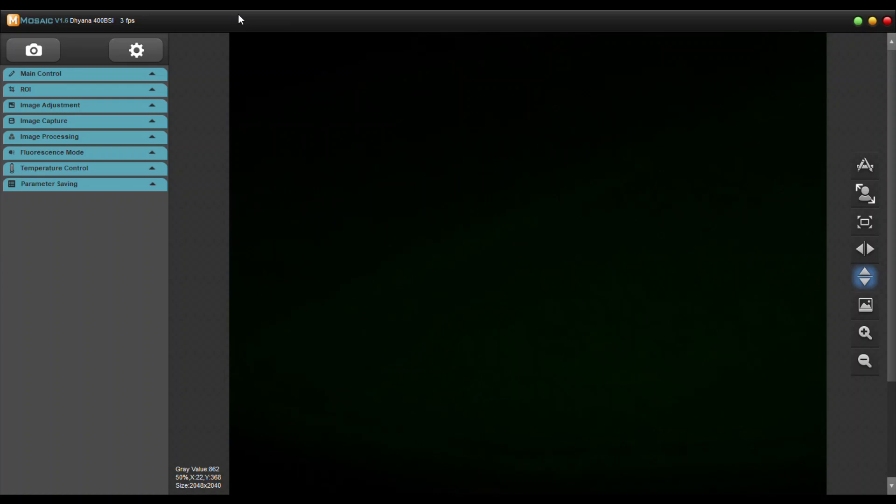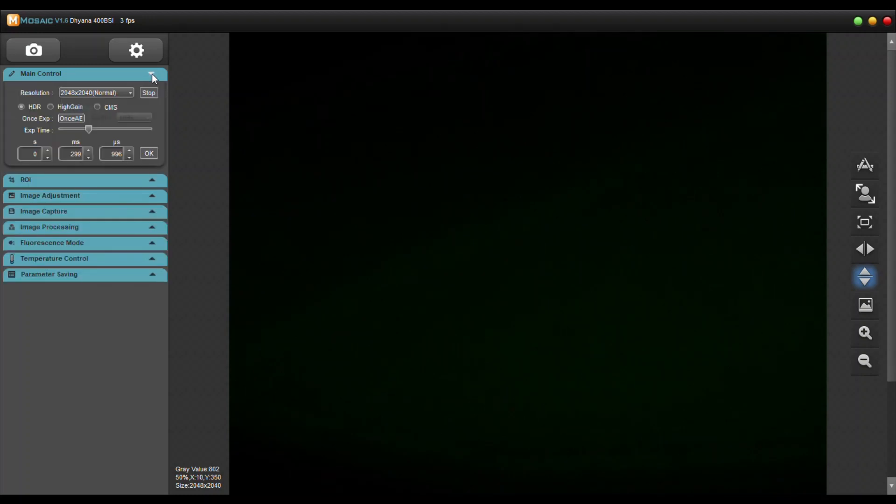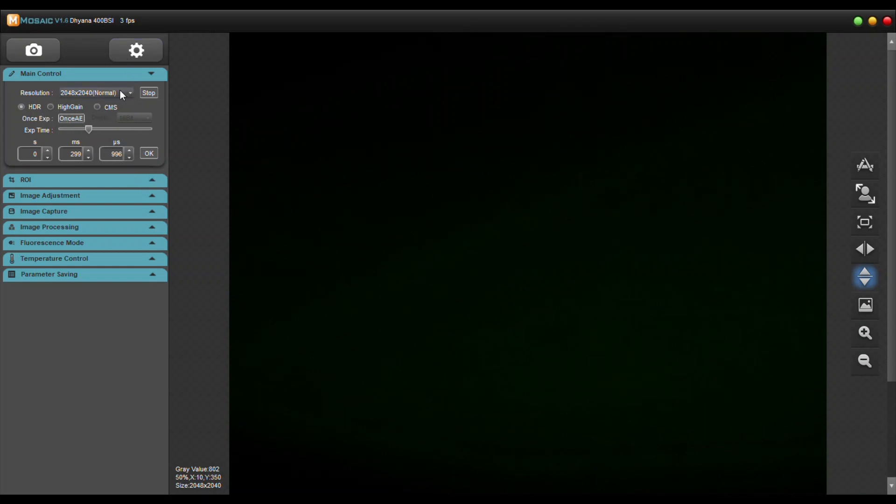I find this software to be some of the easiest software that I've used. You have your main control panel with auto adjustment for exposure. You can click HDR, high gain, CMS. You can change your resolutions.